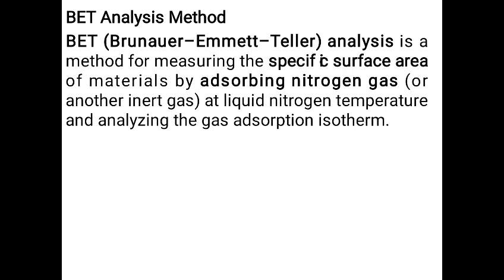BET analysis method, BET, stands for Brunauer Emmett Teller analysis method. It is a method for measuring the specific surface area of materials by adsorbing nitrogen gas or another inert gas at liquid nitrogen temperature and analyzing the gas adsorption isotherm.